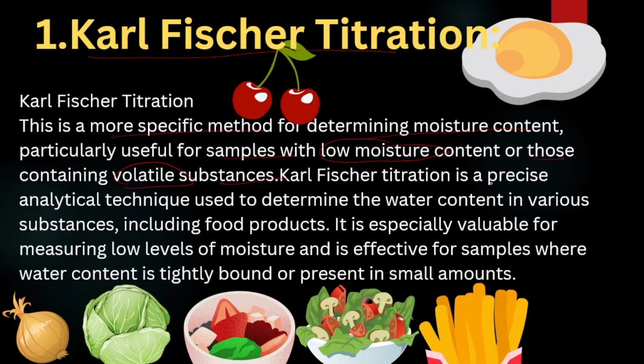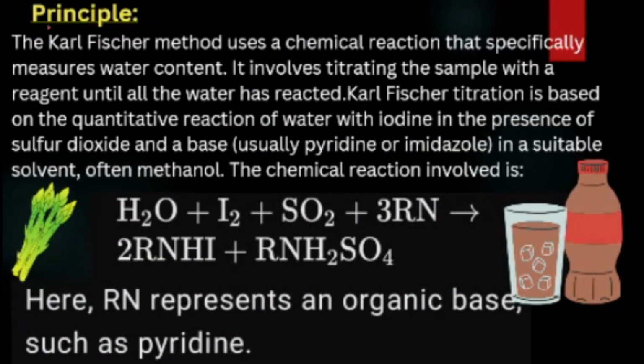This titration is a precise analytical technique used to determine the water content in various substances including food products. It is especially valuable for measuring low levels of moisture, and it is effective for samples where water content is tightly bound or present in small amounts. Coming to the principle, the Karl Fischer method uses a chemical reaction that specifically measures water content. It involves titrating the sample with the reagent until all the water has been reacted.